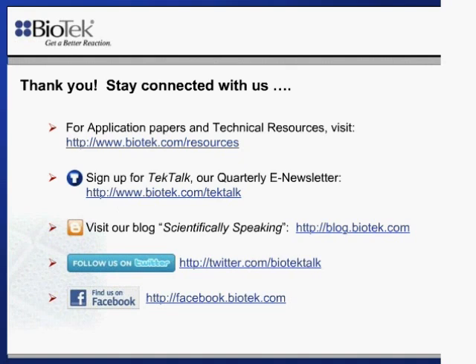How do you generate a calibration for the bacterial growth curve? What we did for that was we did a serial dilution and plated out the bacterial culture, and we counted colony forming units, and then we back calculated using the dilution factors to determine how many cells were in that culture.